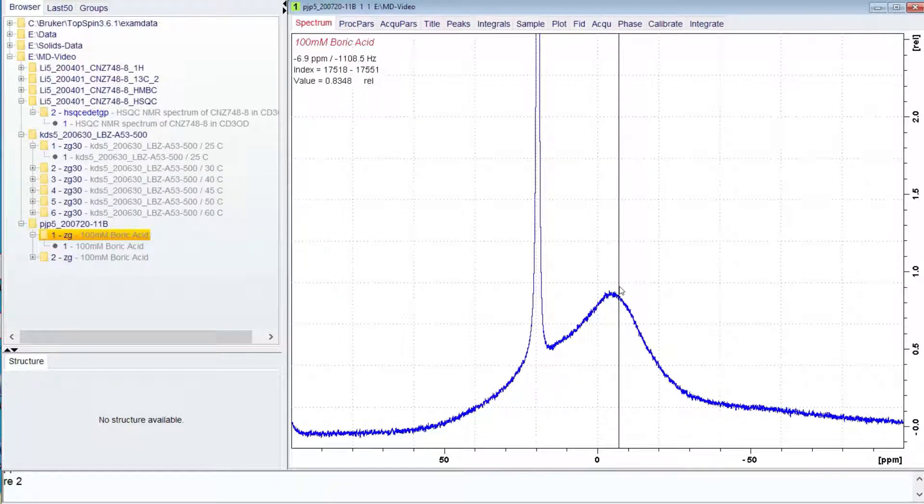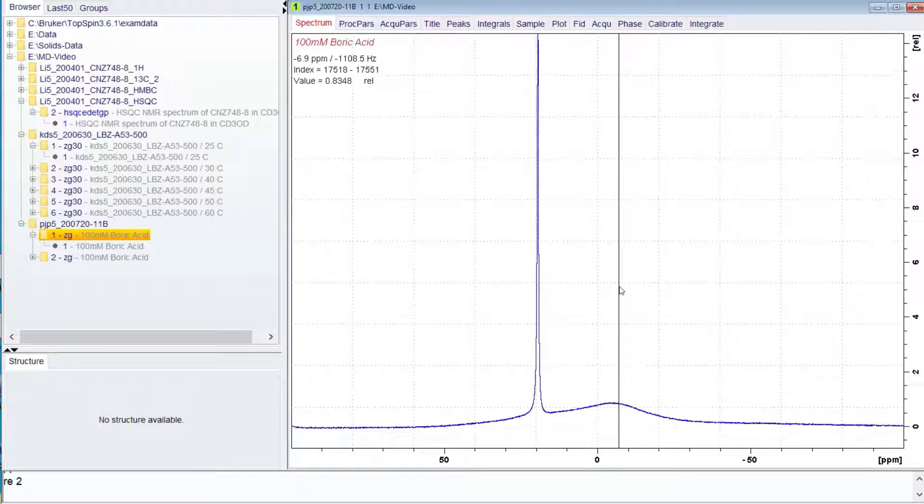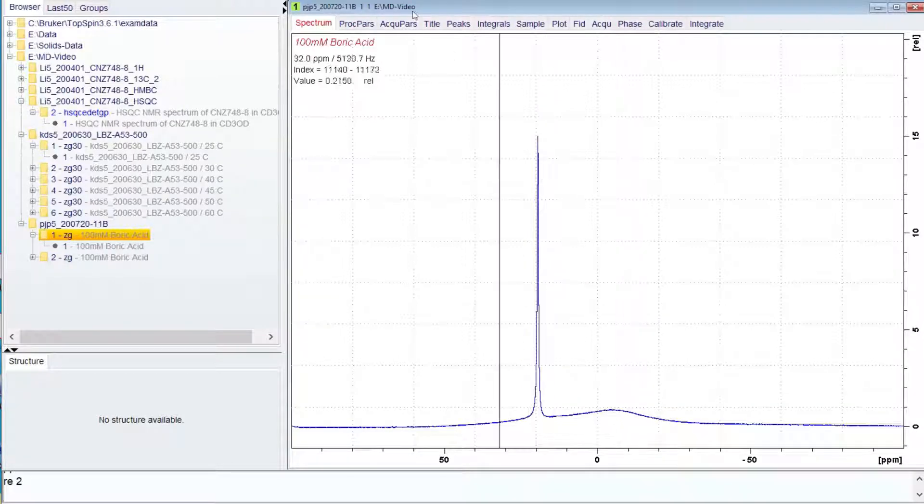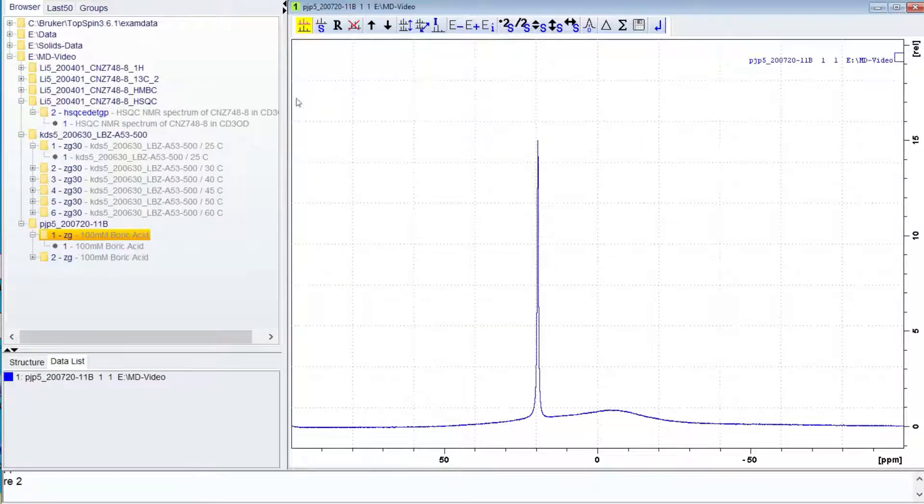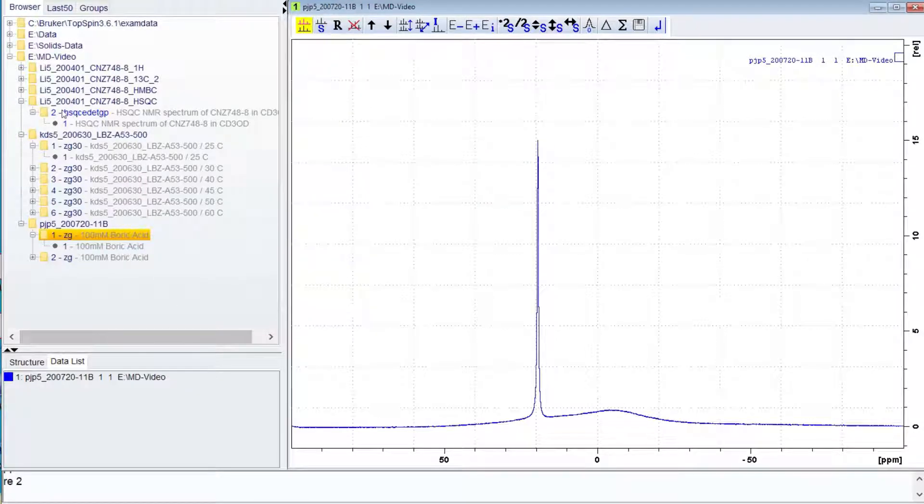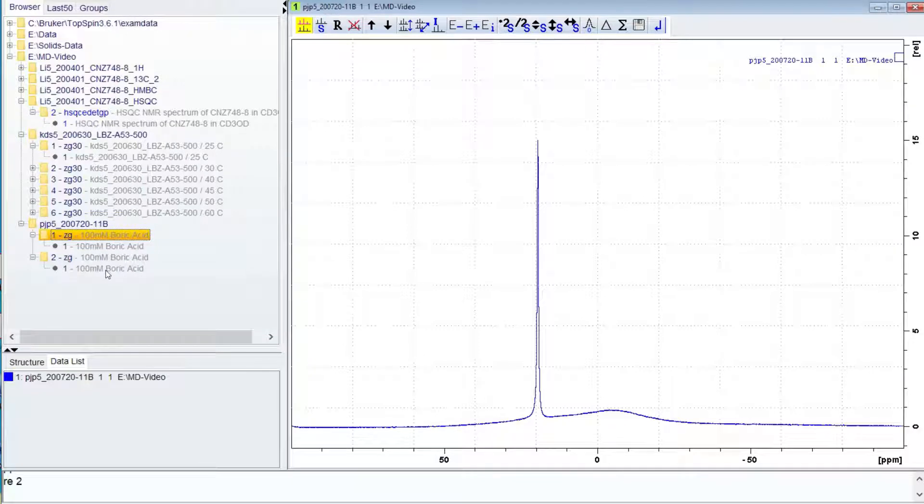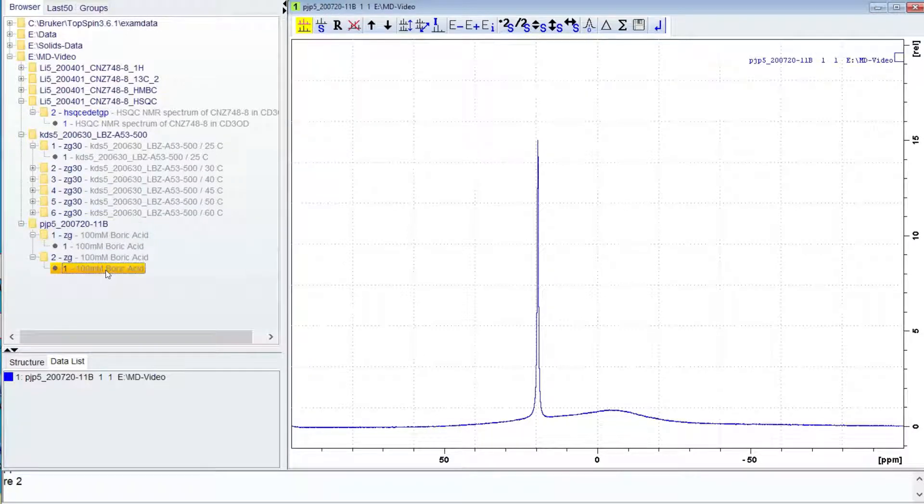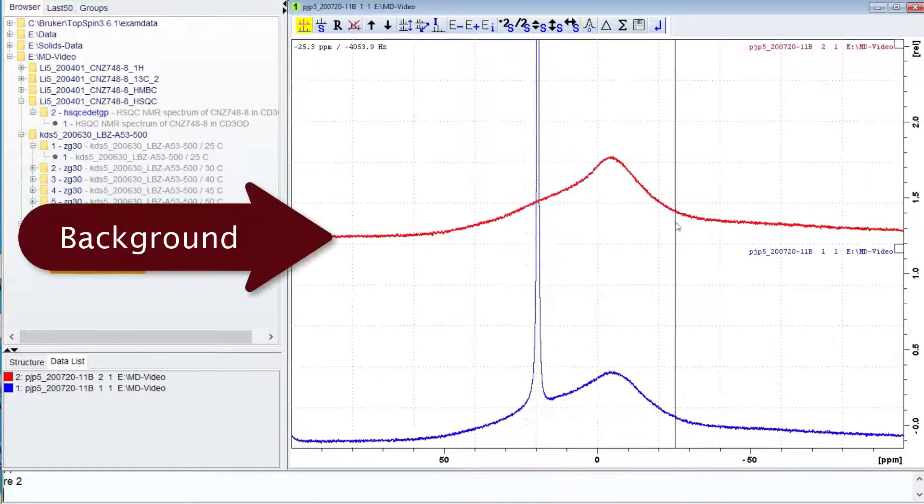If you blow up the vertical scale, you can see a broad peak. This is from the borosilicate glass of the tube and materials of the probe. Every boron spectrum will show this background and it can interfere with the analysis of spectra. If you run a sample that does not contain any compound with boron, you can obtain the background.